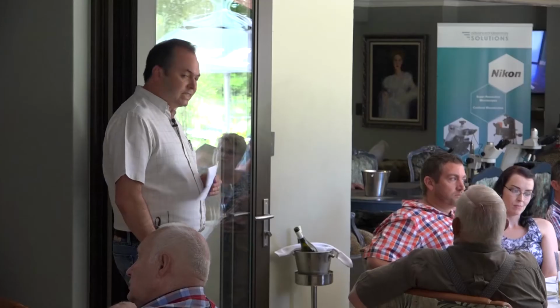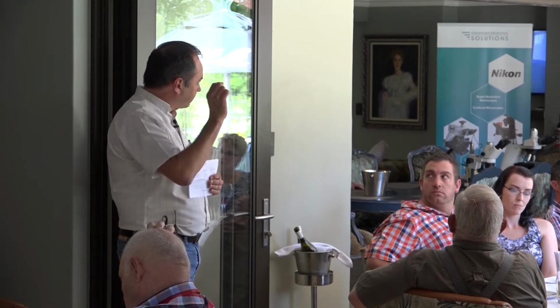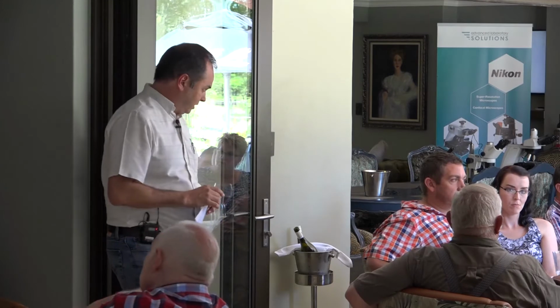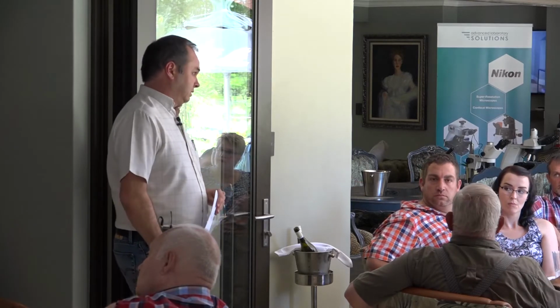Today, that's calmed down because we've reached basically the limit of what we practically need. So, a basic camera today is about 1 megapixel, so 1 million dots of information on the image that you see typically on your computer screen or on an LCD screen that fits on the microscope. And they go right up. I mean, there's cameras of 70 megapixels. Now, I thought I would talk about that a little bit.